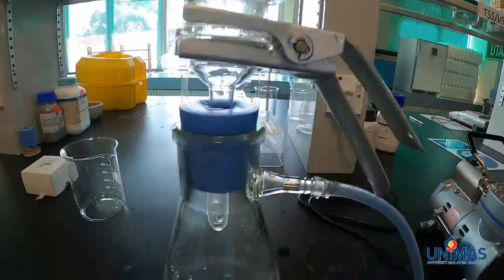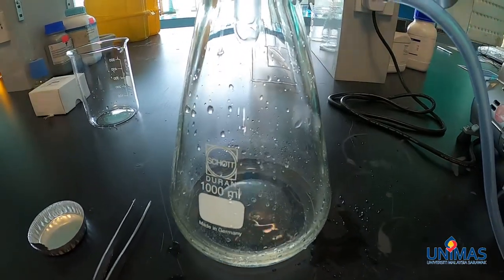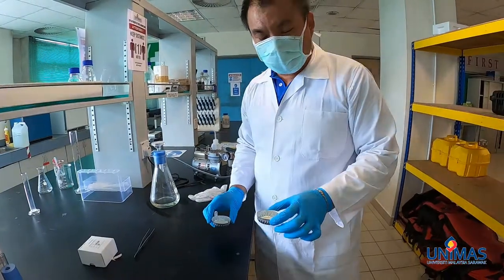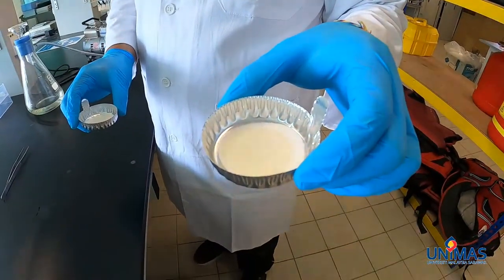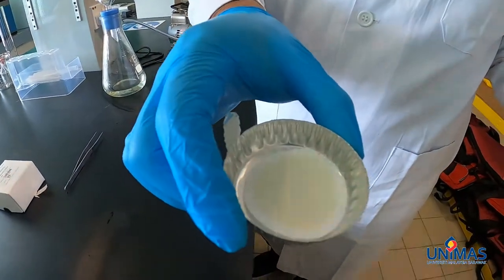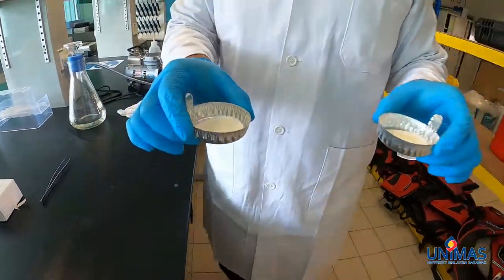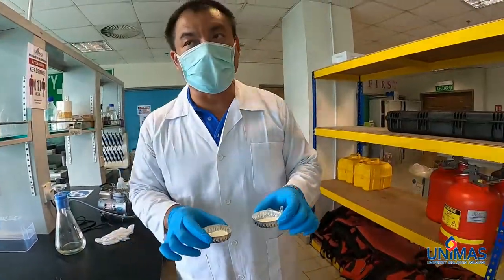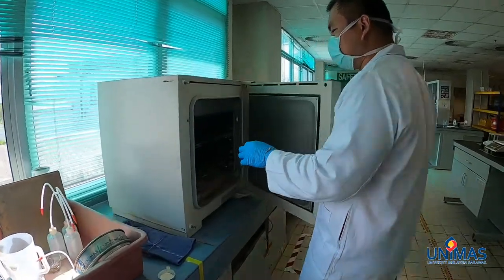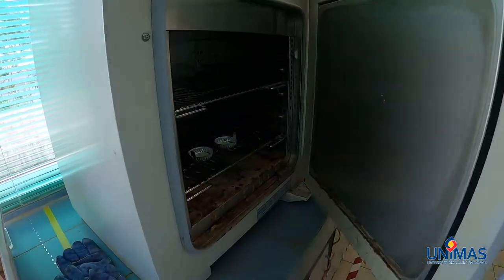All the water has already passed through, so we can switch off the vacuum pump — we are done with the filtration. This is the sample from the outlet of UNIMAS Lake, and this is the sample from the boat house. We are now going to put them into the oven at 102 degrees Celsius for one hour.